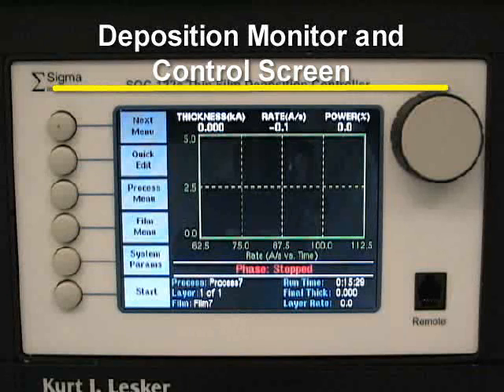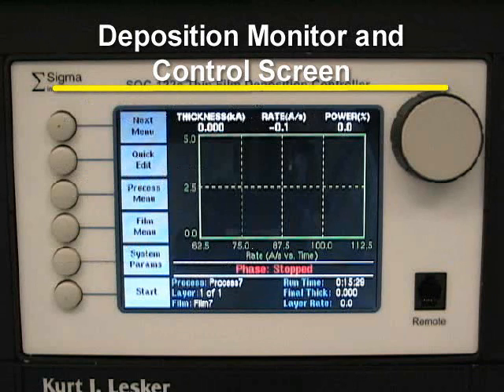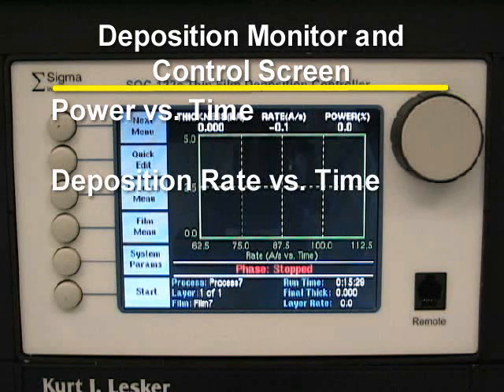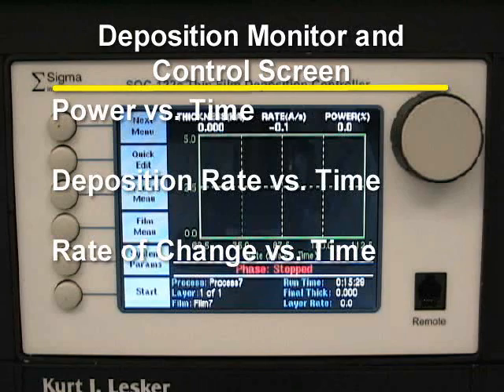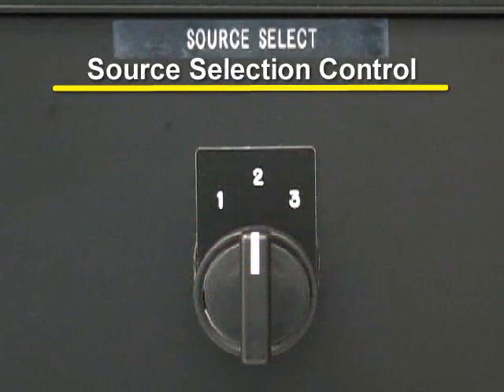The deposition monitor and control screen is where the processes and films are selected, edited, and displayed. It shows the processes selected, types of films being used, and displays different graphs during deposition. These graphs include power versus time, deposition rate versus time, and the rate of change of the deposition rate versus time. There is also a source selection control — this dial selects which pair of electrodes will receive power during processing.